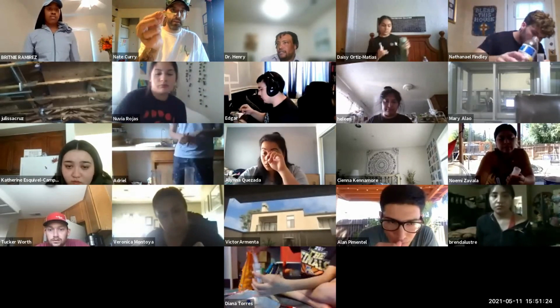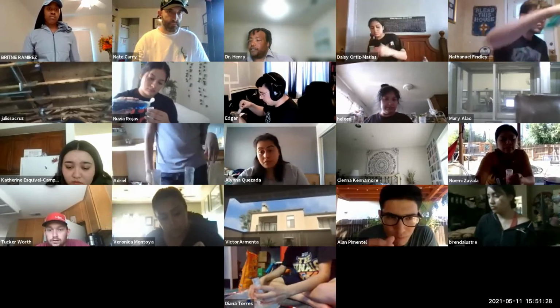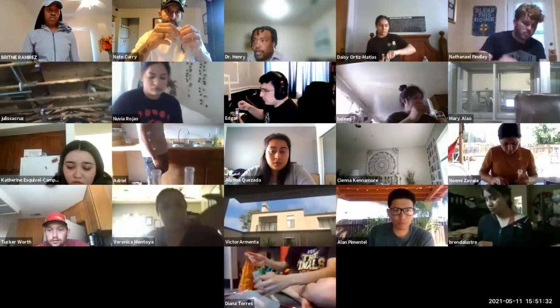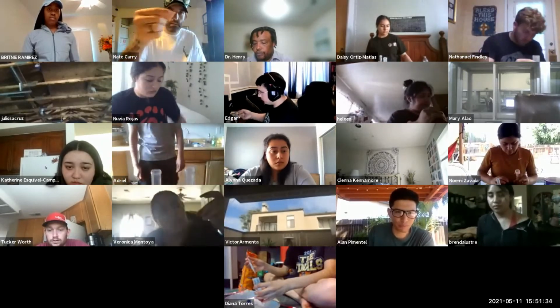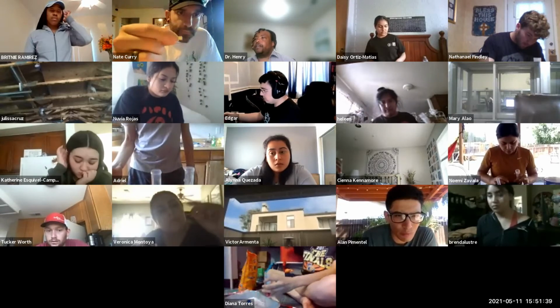Here, I got enough. Okay, alright. So do me a favor. Just take a little, rip off a little piece of it. Rip off a piece. Yep. Okay, now just use that to dip in there.